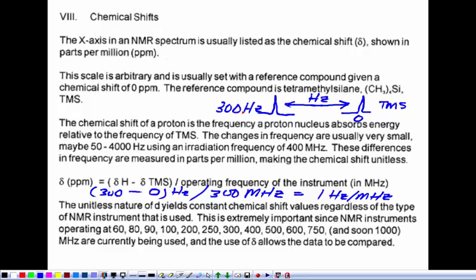Okay. So the chemical shift scale then is independent of magnetic field strength. And as we go through, we're going to find a number of different things that will depend on the magnetic field and those that don't. Chemical shift doesn't change. Larmor frequency of the nucleus, though, it does. Okay. So that's what the x-axis is. Everybody kind of with me?